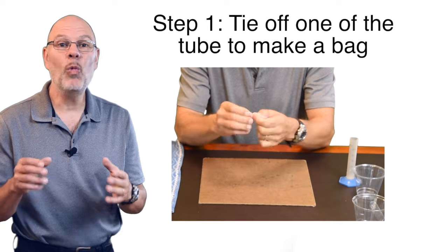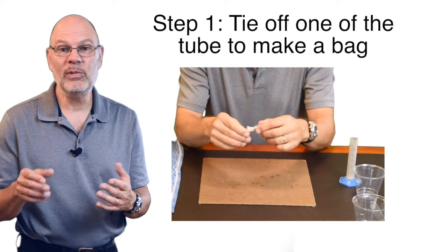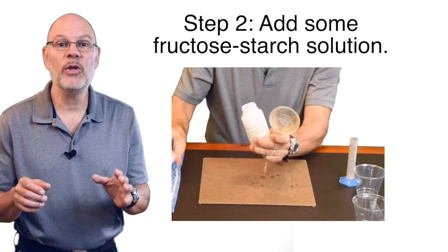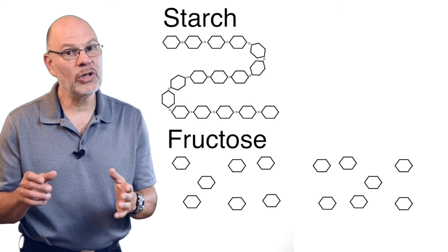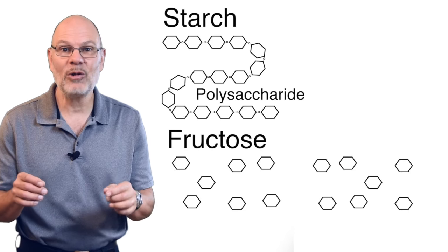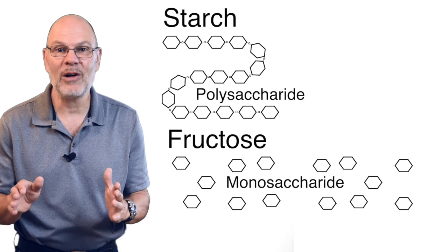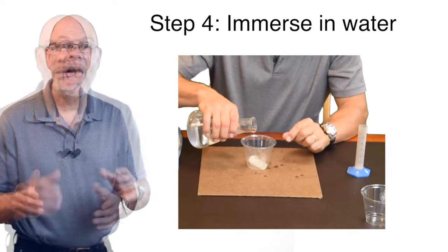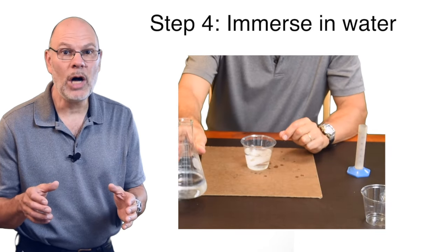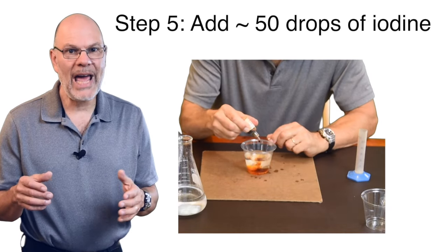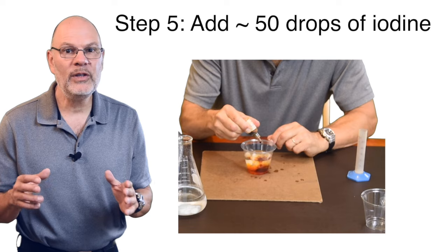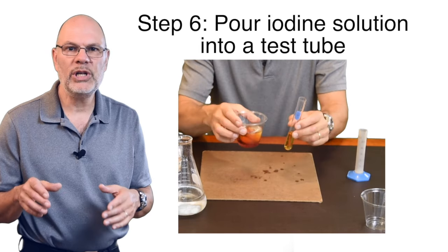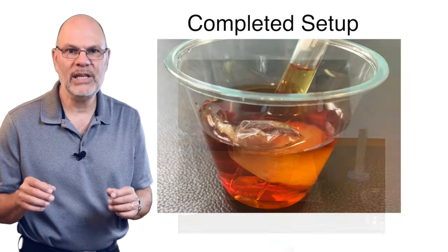I'm going to tie off one end of the tube to make it into a bag. I'm filling the bag with a solution that contains both fructose and starch. Starch is a polysaccharide and fructose is a monosaccharide. I'm sealing the bag by tying the other end and placing it into a cup of water. Into that cup, I'm going to add about 50 drops of iodine solution. I'm going to pour off a bit of the solution in the cup into this test tube.